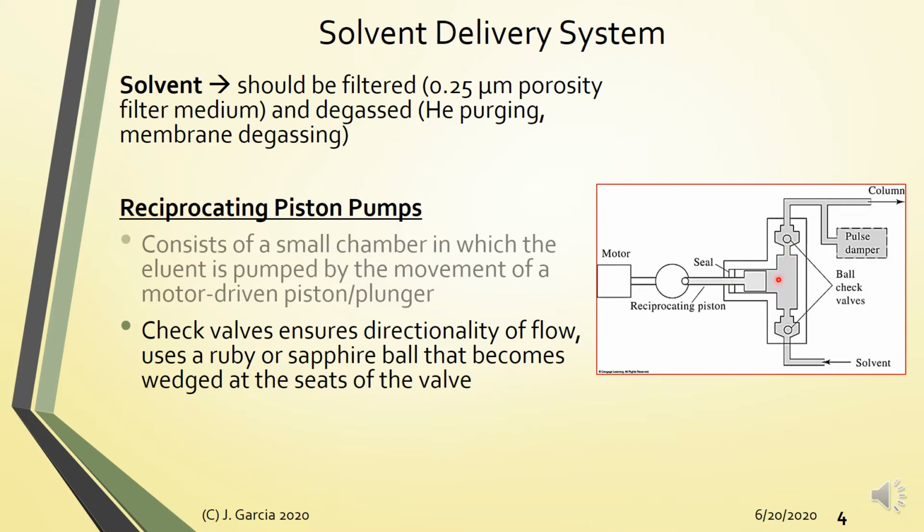Then the forward motion of the piston, ano mangyayari? Yung check valve naman na ito ang magbabara, magsasara dito, preventing the mobile phase from going back to the solvent reservoir, whereas this ball check valve is open, forcing the mobile phase into the column.